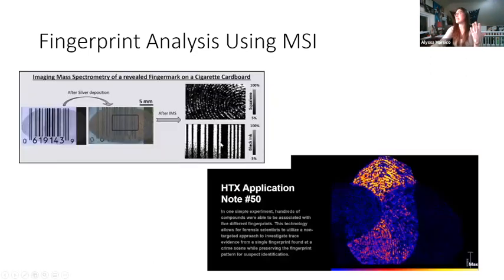We also do this, like I said, to deduce fingerprints that are on a very noisy or difficult background. In this case, this is a fingerprint on a cigarette container over the barcode. And you can see that the barcode is obscuring some detail, right? Black and white, it's very difficult to find a fingerprint powder or something that you can use to basically enhance this fingerprint without losing information. With Mass Spec imaging, we figure out ions that are unique to the ink versus the fingerprint itself, and we can separate the images.